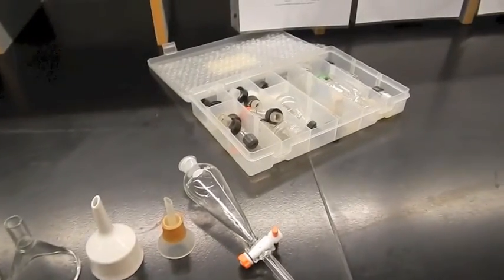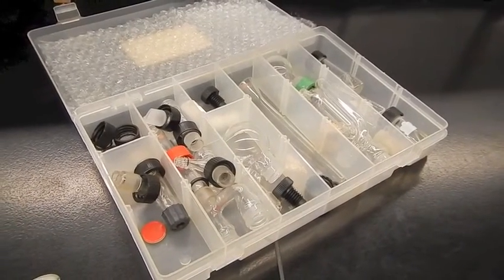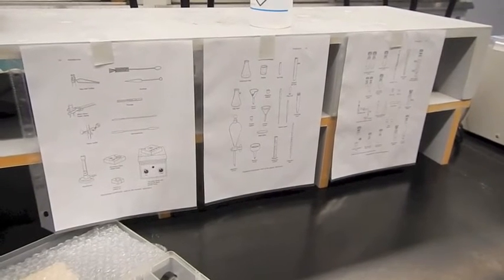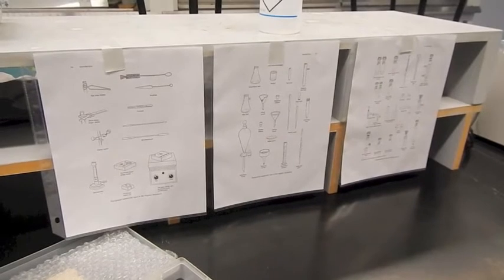You'll also find that you've got this whole slew of crazy looking pieces of glassware. Now, these all have names, and if you look up here on these charts that are at each pod, you'll find what name each one of those crazy looking pieces is supposed to have.